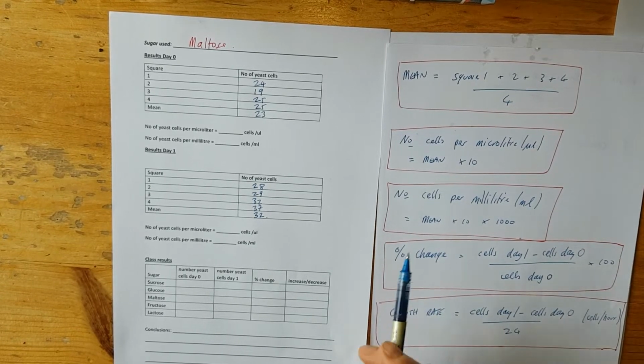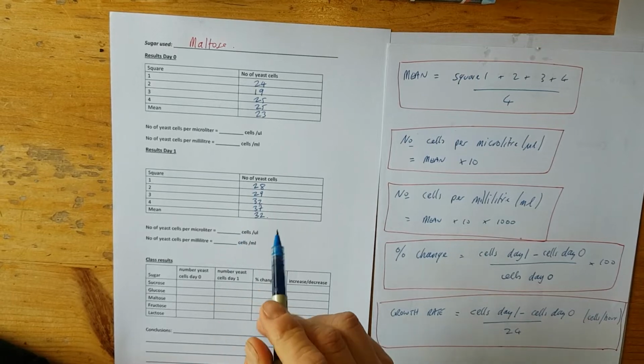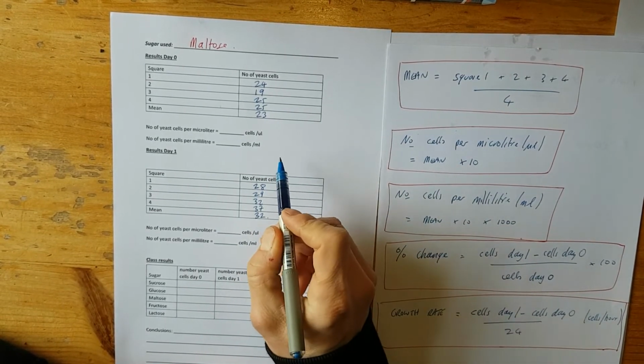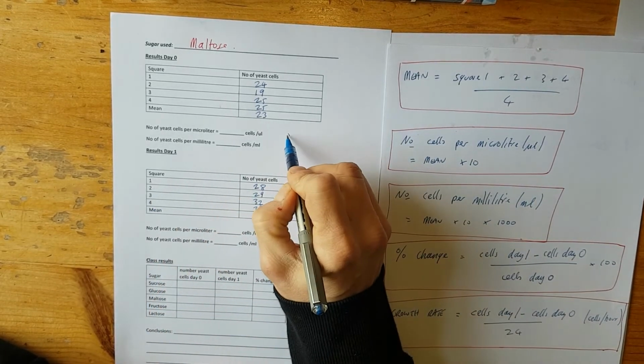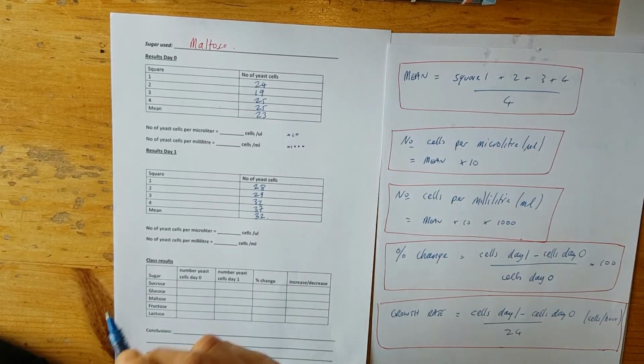Number of cells per microliter, we need to times that by 10 because of the dimensions. It was 1 times 1 times 0.1 millimeters. So we need to times that by 10, and then times that by another 1,000.